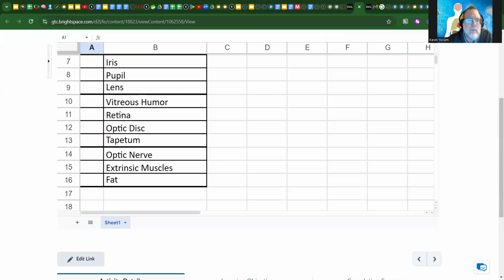When we cut the front away from the back and remove the foyer, or the anterior chamber, we're going to try to keep the vitreous humor and lens intact initially, so we can see how the retina is fanned out and maintaining its shape. And then we're going to dump the vitreous humor out, and you'll see how the retina just basically folds in onto itself.